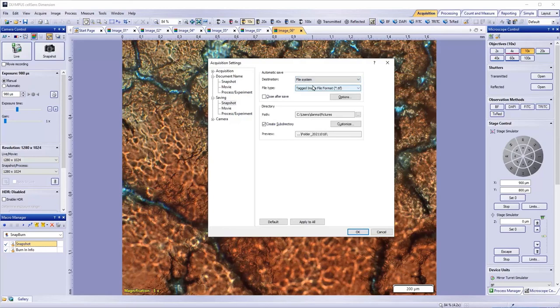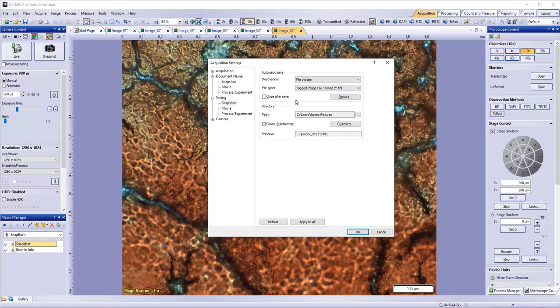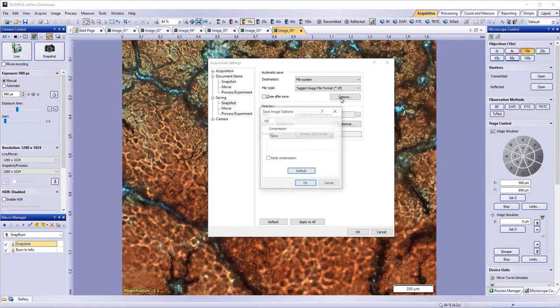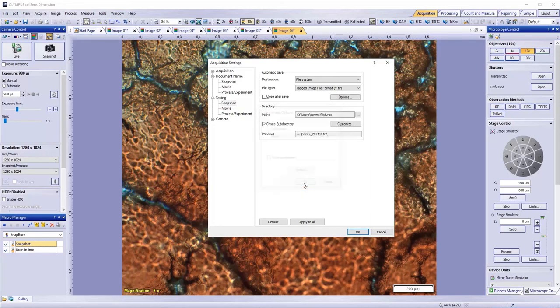File System enables you to select the type of image it will be saved as. We recommend TIFF for most applications. If you want to compress your images, choose Compression in Options. Select Close after Save if you would like the image in CellSense software to close once it is automatically saved.